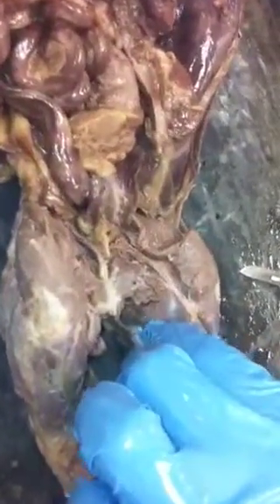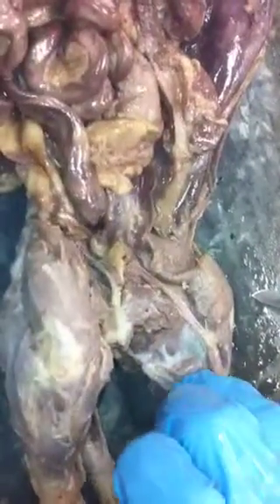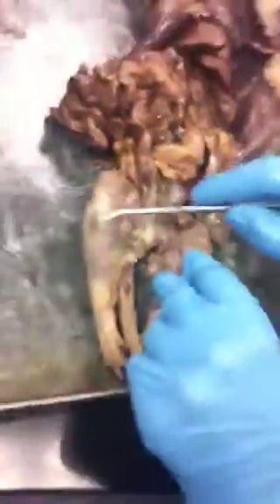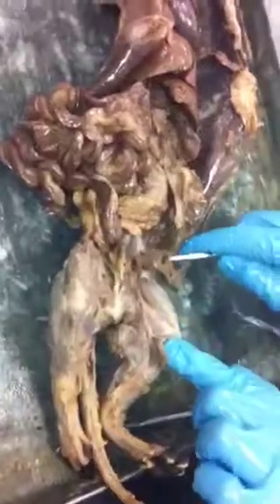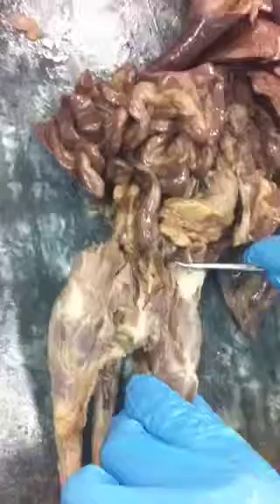What are you following back? I'm following back the sartorius? No. Gracilis. See, this is sartorius and all that's gracilis. So we're cutting back to gracilis, right? Okay, here we go. We'll start over. You have your whole foot. This is when you cut this muscle, it becomes a sartorius. This muscle that's cut, sartorius. Showing the rectus femoris.